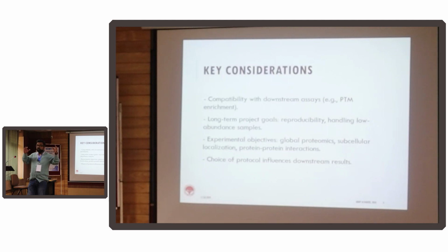And you see, when we are talking of a systems approach, even the smallest perturbation can have the largest impact. So then again, you have to design your experiment in a way that your highly abundant proteins do not mask the signals, and most signaling molecules like cytokines, even the small signaling receptors, they are usually very low amount. They are not highly abundant, and if it is masked in the mass spec, then you lose out. So people who are doing cell surface proteomics, there are ways of enrichment. I won't be able to tell you everything, I'm giving you the fundamentals, so that while you plan your experiments, you do it likewise.